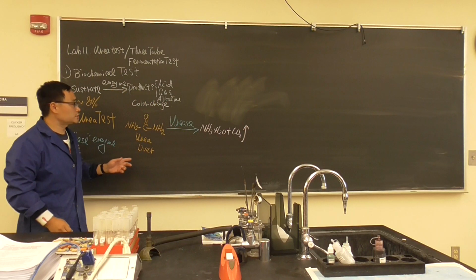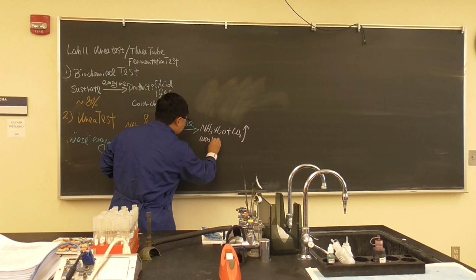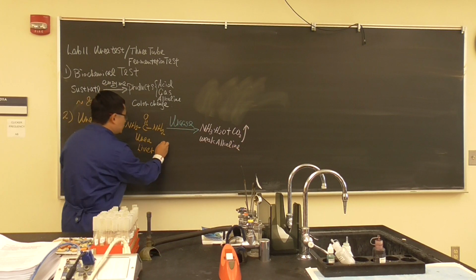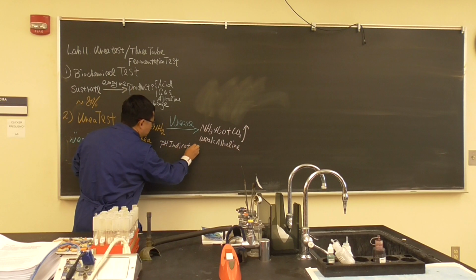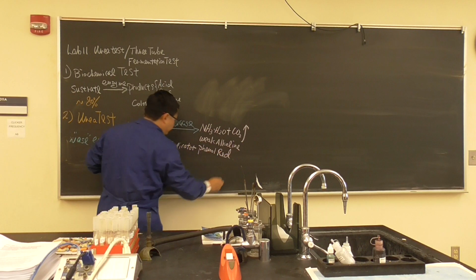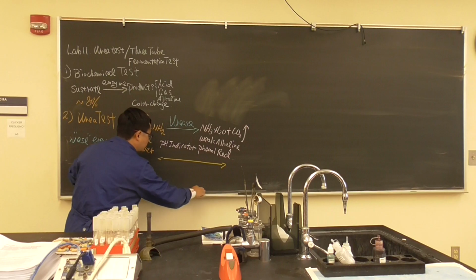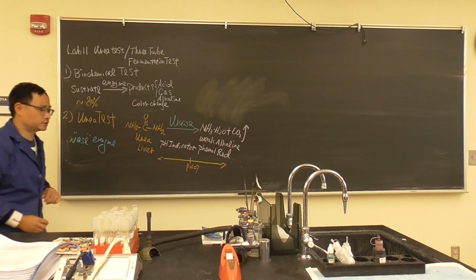Now, how do we know ammonia is generated? Because ammonia is a weak alkaline. So in this solution we add a pH indicator, which we mentioned before, called phenol red. Phenol red is very interesting and a useful tool in biochemistry reactions. At pH 7, neutral pH, it shows its original color.